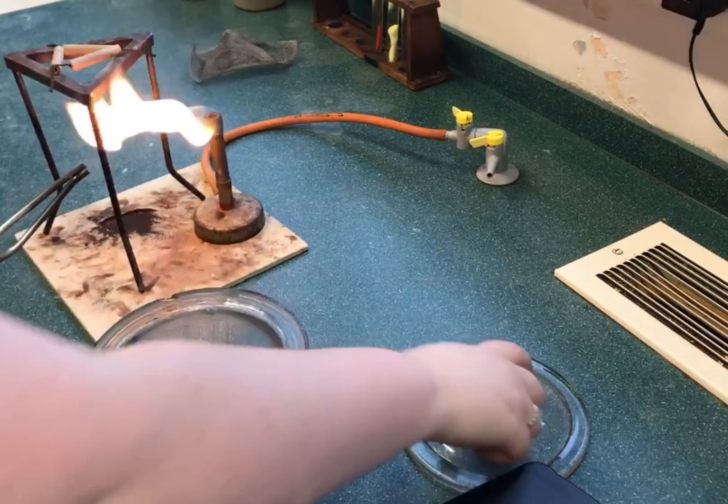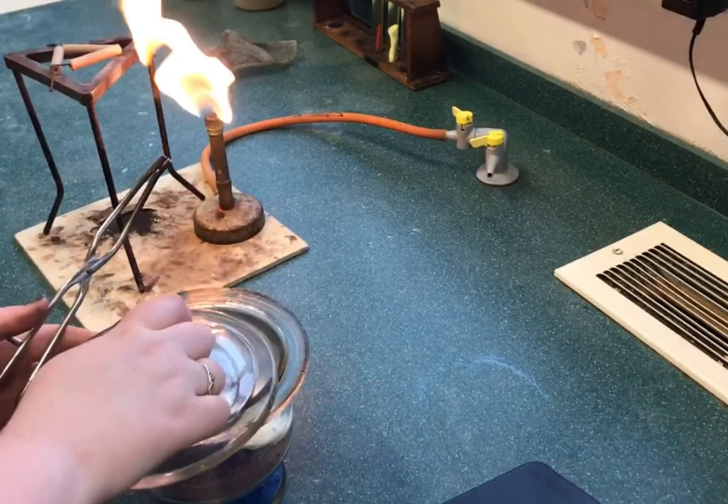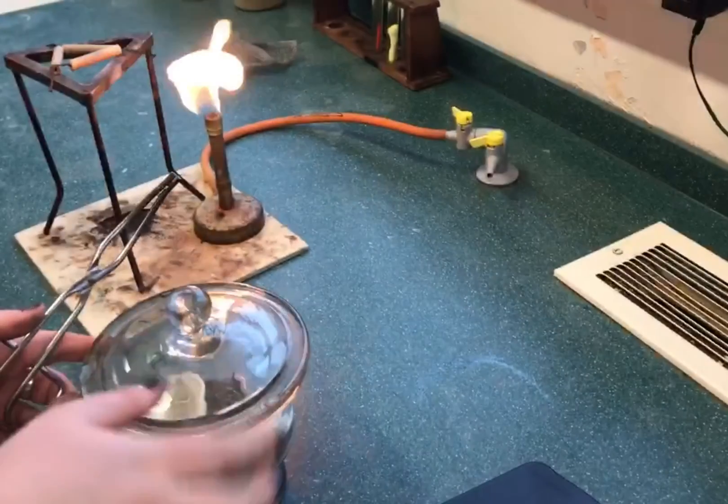This process is repeated until we reach constant mass. This means we get two readings of the same mass.